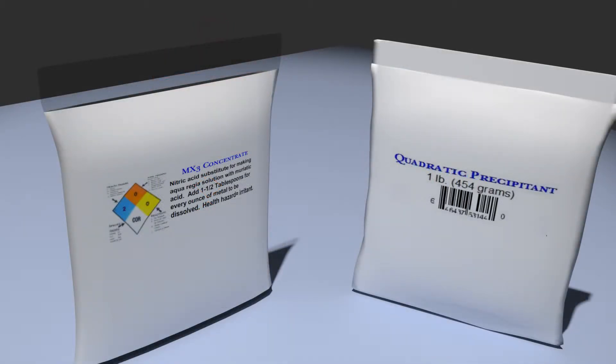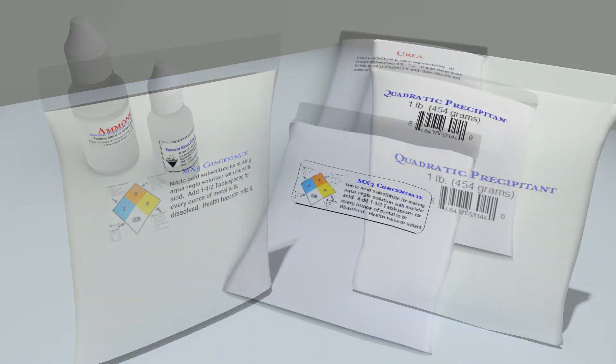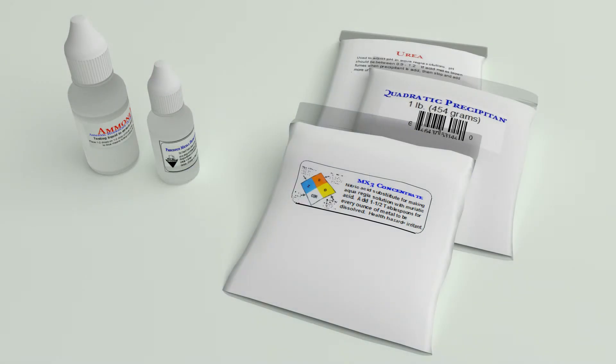These safe substitutes, MX-3 and quadratic precipitant, are utilized in this kit. Just follow these simple video instructions and you will refine your gold to 99.95% with no losses, even the first time you use this process.